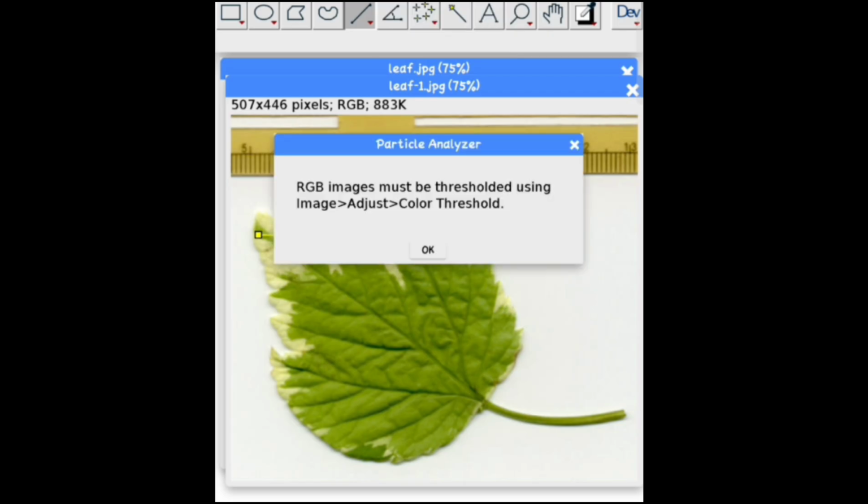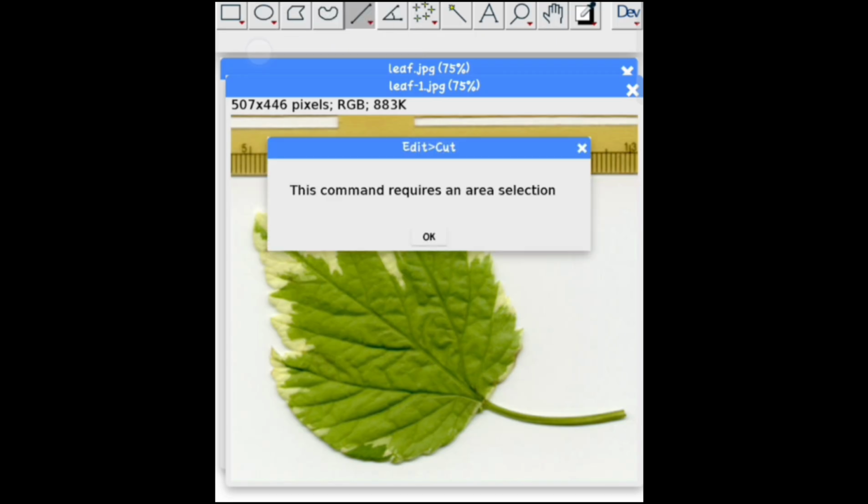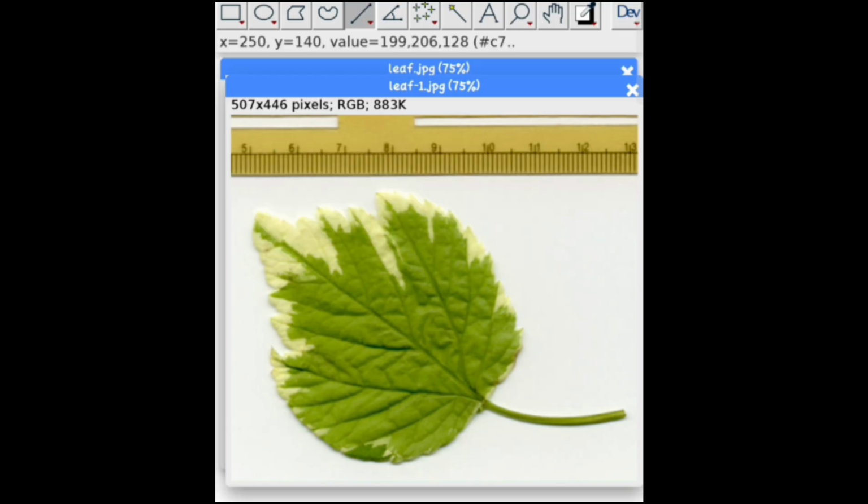For that, the next step is analyzing. We can analyze and enter the value in Analyze for getting the area and all. We can even use the rectangle tool for knowing the width and the height with the x and y axis.